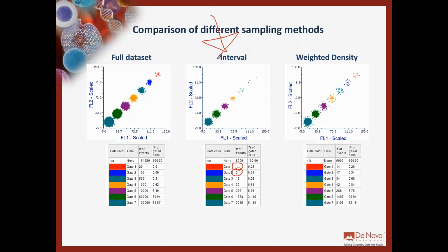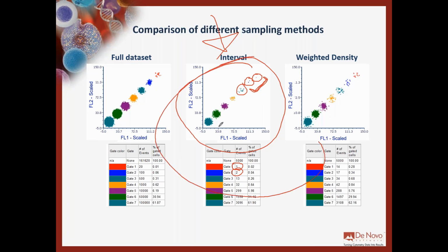So if you are in this scenario and you ask an algorithm to find clusters, or maybe you ask tSNE to create some islands, it will be very hard for the algorithm to understand that this is a population and this is another population and this is another population. Probably those two will be considered as a unique, very rare, sparse population because there is not enough information. Okay, you have a lot of information here, here, here, but not enough information here.